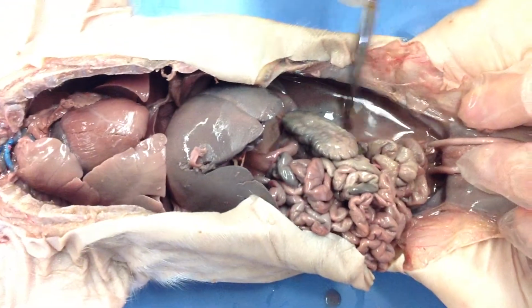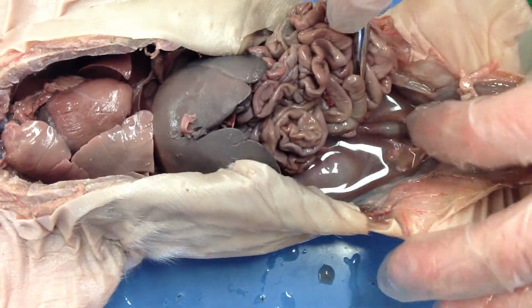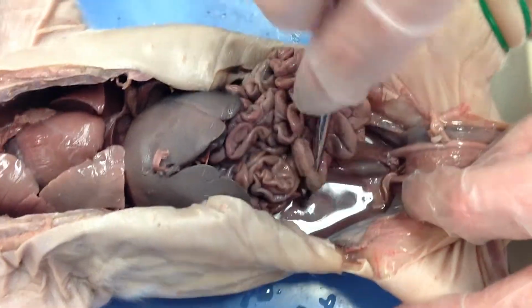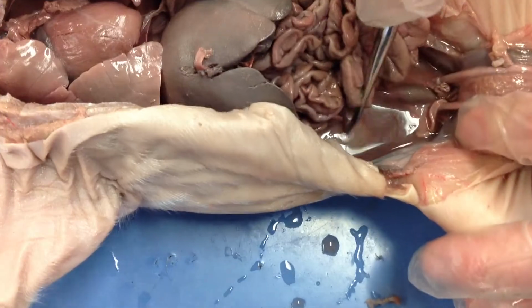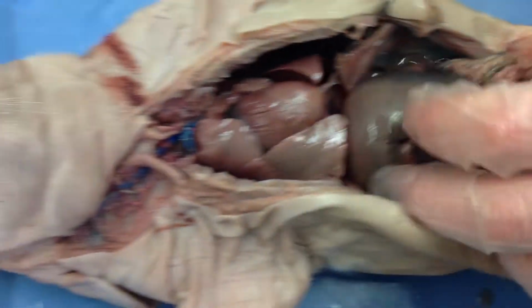Okay, and you have to try to trace, we would have to take some of this fluid out, but there should be a tube called the ureter going from the kidney to the urinary bladder.